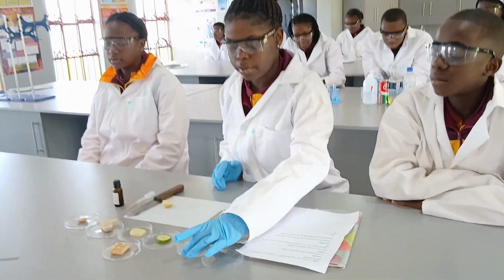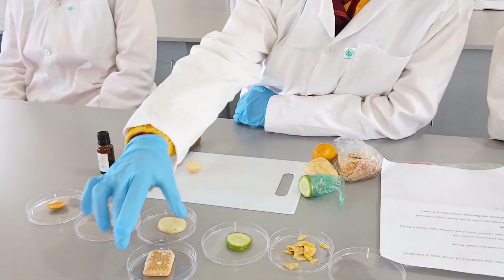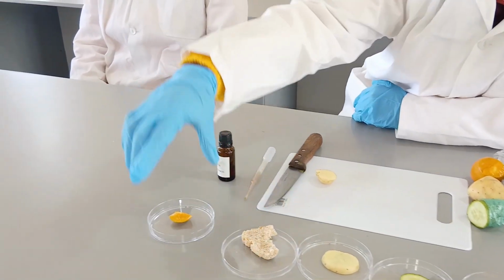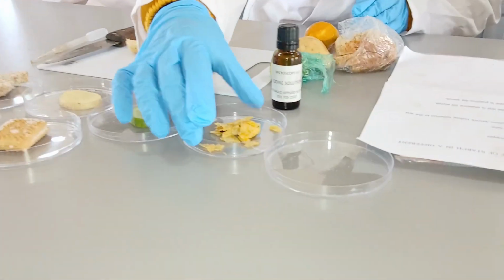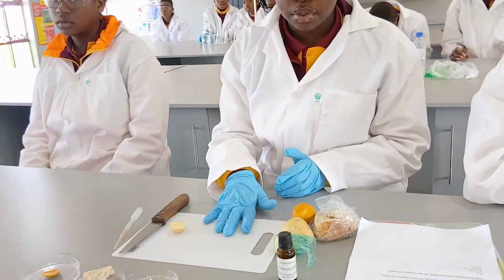Here we have a raw potato. Here we have a cucumber. Here we have one biscuit, a cooked potato, some bread, and also a mango. The materials that we have with us today are the iodine solution, our food samples on top of petri dishes, a knife, a dropper, and a cutting board.